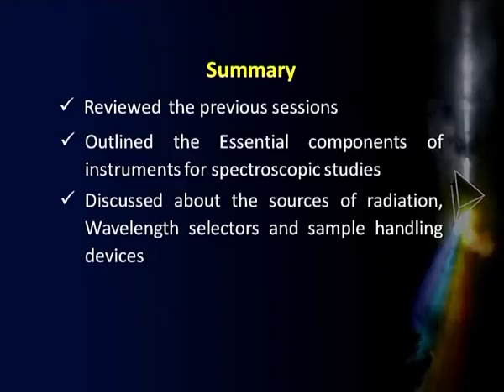After having done that, for each kind of spectroscopy which we are going to take up in this course, we have talked about the sources of radiation. What do we do in the case of microwave spectrometry, or vibrational spectrum measurement, that is in the IR region or UV visible region. So, we have seen what sources are used for different types of spectroscopies.